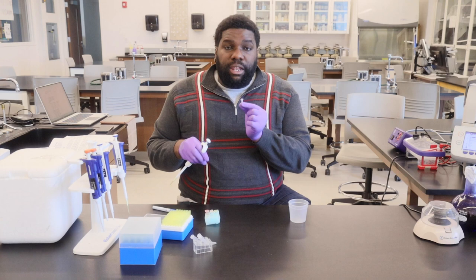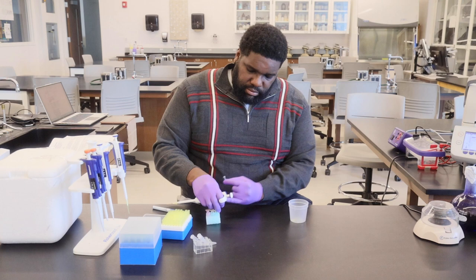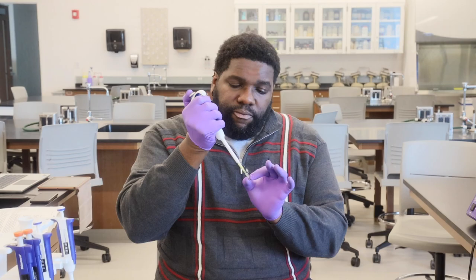Also use a fresh tip to transfer in your master mix plus primer. Then we want to mix the two together. To mix it, you can just tap the Eppendorf tube gently, or you can pipette the solution up and down a little bit.